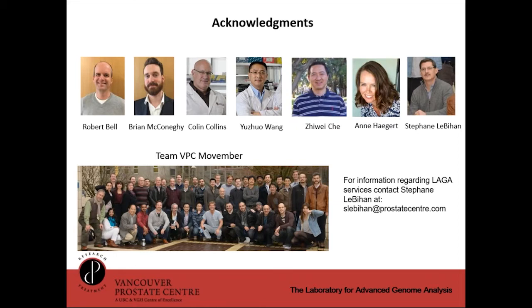Great, thank you. And I would just like to add that we actually have tried the algorithm with less than 1x coverage, and it has worked. We do have a white paper describing some of these results. And at a recent AACR meeting, one of the customers presented some low-pass sequencing data where they'd used 0.5x. This was with the previous algorithm, but it should be working just as well with this one.